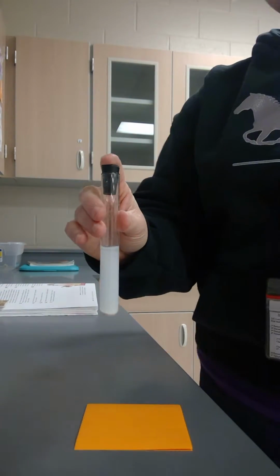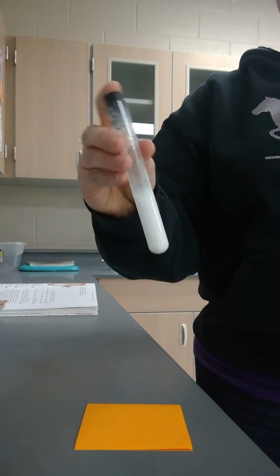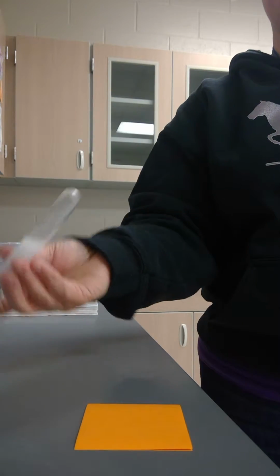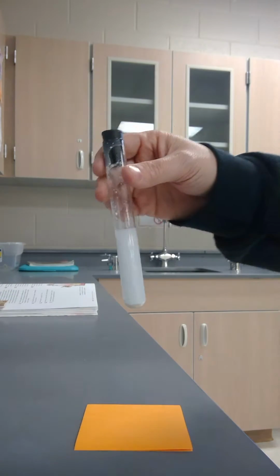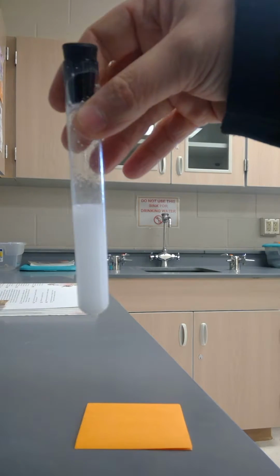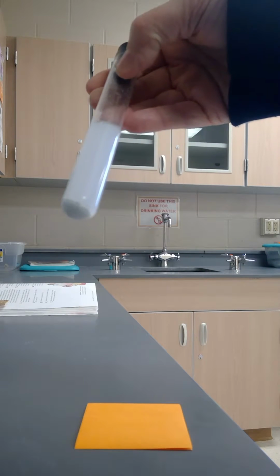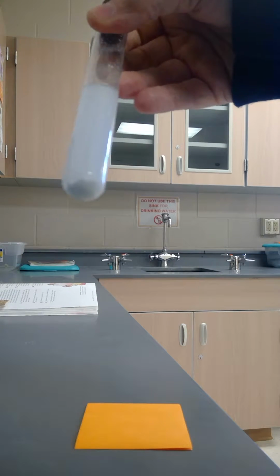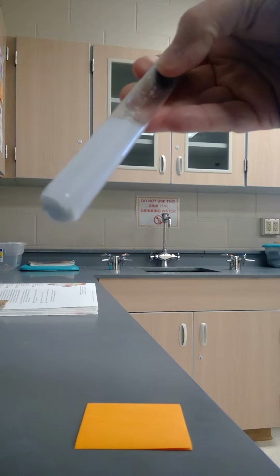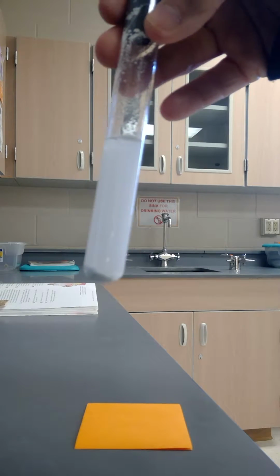Do you remember how many times I'm supposed to mix it? Take a look at your table. 10 times. 1, 2, 3, 4, 5, 6, 7, 8, 9, 10. Now again, I'm going to write down my observational properties. See there at the bottom, you might identify how well it's mixing or how well it's not. And some of the zinc oxide is pooling down at the bottom. Excellent.